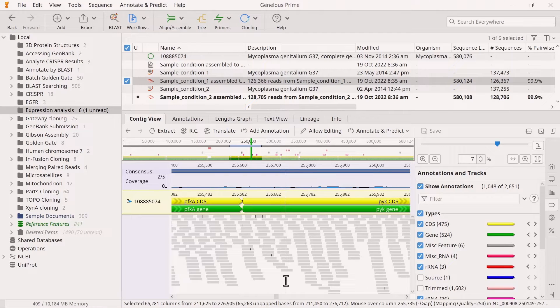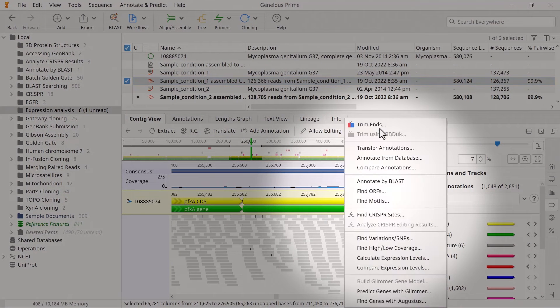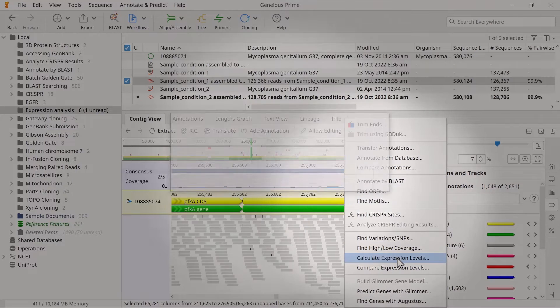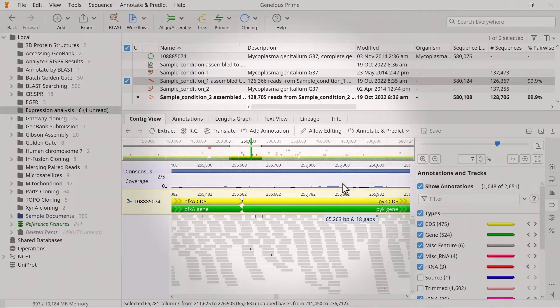Next, we will use the assembly files to calculate the expression levels of the different genes. To do this, select an assembly file, go to Annotate and Predict, and choose Calculate Expression Levels. In the new window, specify how you want to treat ambiguously mapped reads and the annotation type of interest. I will leave the settings as default and click OK.